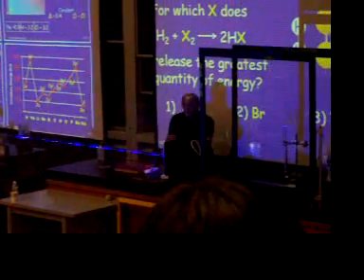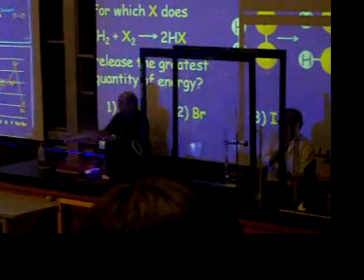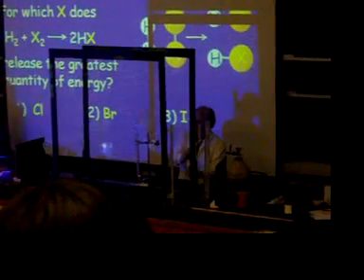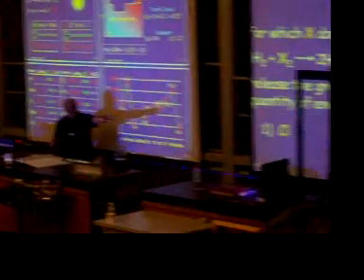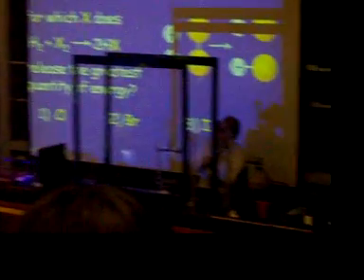And you can see he stops it over here. He doesn't want it to blow up before he gets a chance to get away from it. So all the way from here to here, I'm going to do something over here, and Lottie's going to be standing over there, and then we'll see if a reaction occurs.